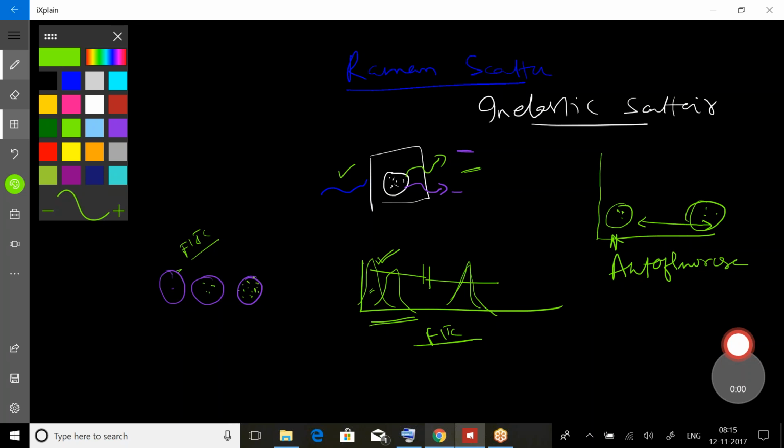So it's a biparametric plot, two parameters displayed here. So autofluorescence, and whenever there is specific fluorescence, if we have a population having intermediate expression of the protein like this one, it will have moderate fluorescence, somewhere in between. And fluorescence and Raman scattering happen in all directions, and for the sake of the instrumentation, they are collected at a 90-degree angle. I will be talking in detail about this when I talk about the anatomy of the flow cytometer.